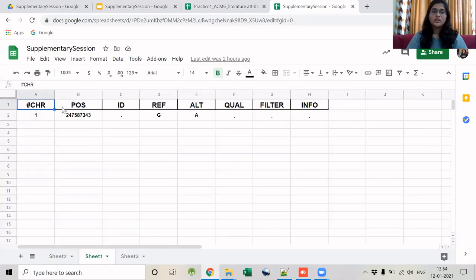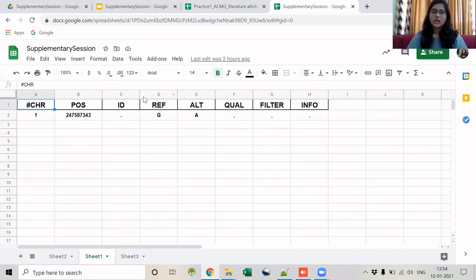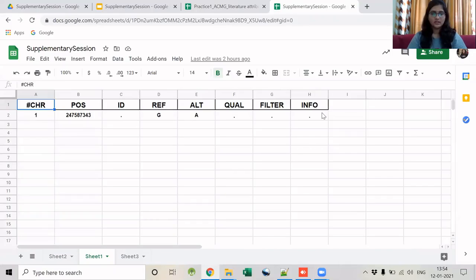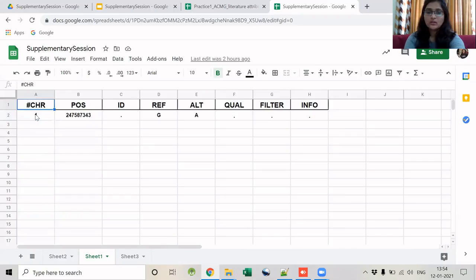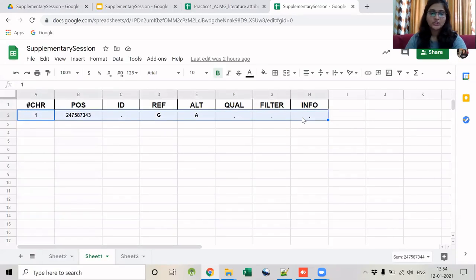To create the VCF format, I put the chromosome number in column 1, the position in column 2, a dot in column 3 (the ID column, since that detail is unknown), the reference base and alternate base as mentioned in the genomic coordinates, and three dots in the next three columns for the unknown fields. I will then use this line with VEP to understand the annotation.